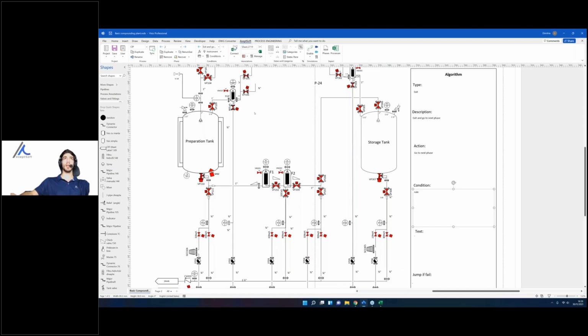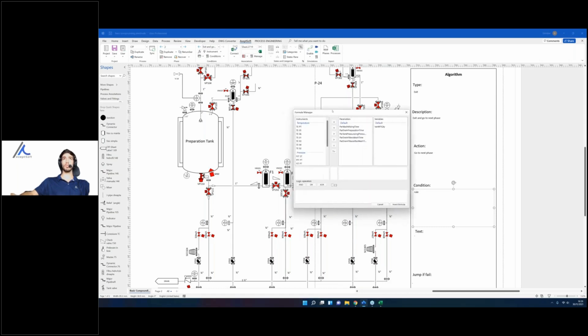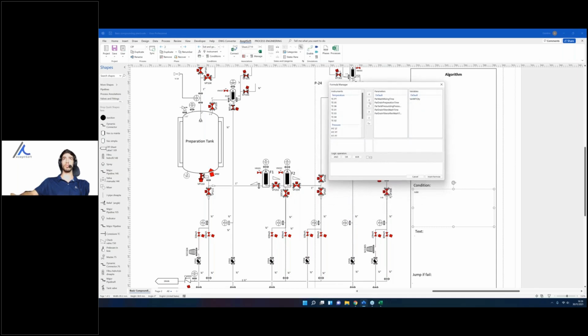But now let's add a more interesting formula. We need to specify a condition based on instruments, parameters, and variables. Now, when we were doing it on paper, it was very difficult, because specifying the instruments, parameters, and variables was a very tricky part where you could get lost in the names of them, and making a very formal definition was very prone to mistakes.